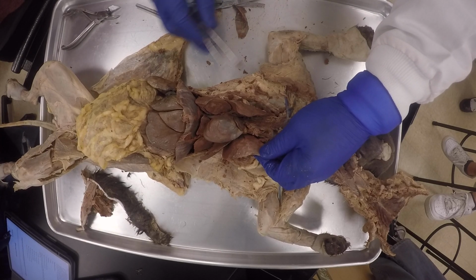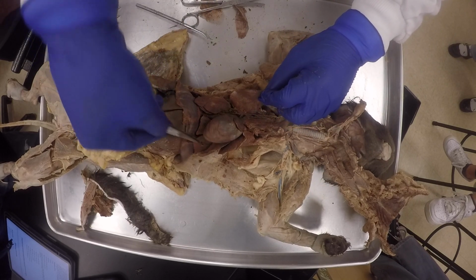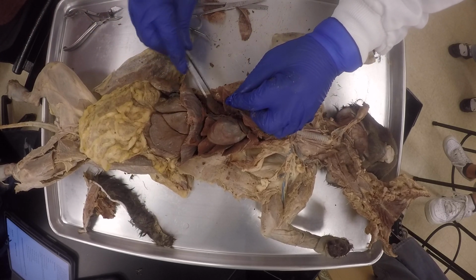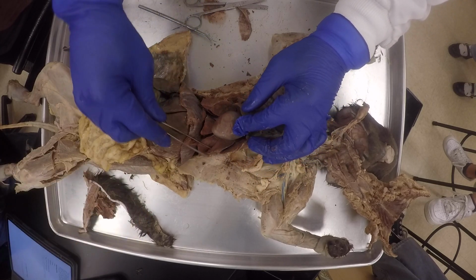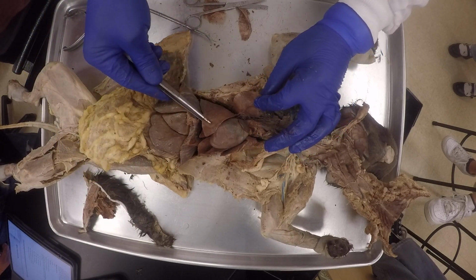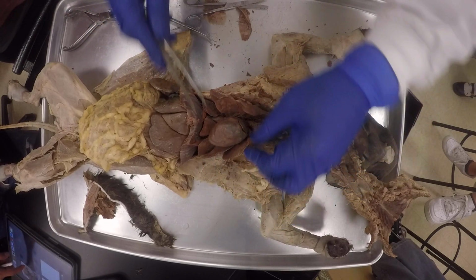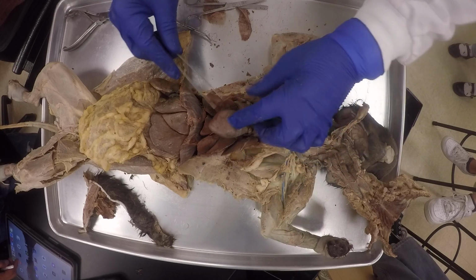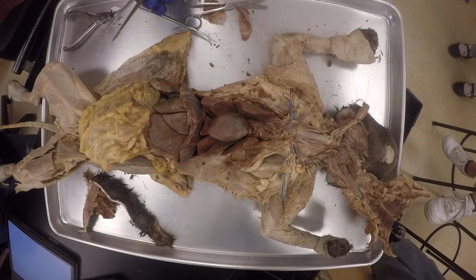Okay, fine, thank you. Now this is the right apical lobe, right? And this is the left diaphragmatic lobe. Okay, right diaphragmatic lobe, intermediate lobe, and cardiac. Left cardiac lobe. Okay, and of course right cardiac lobe. It's not going to be like this in the exam. It's going to be just like that in the pictures. It's not going to be cradling the heart like that, but I'm just doing it for example, so you know the one that falls on the side like that is definitely the cardiac lobe. You just have to decide whether it's left or right.